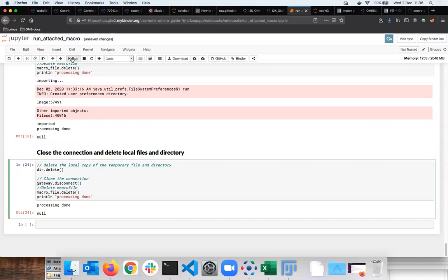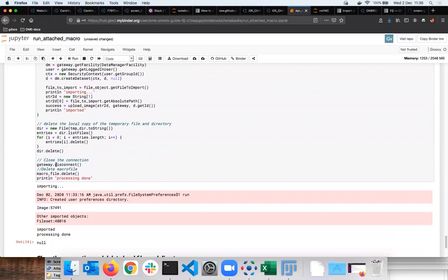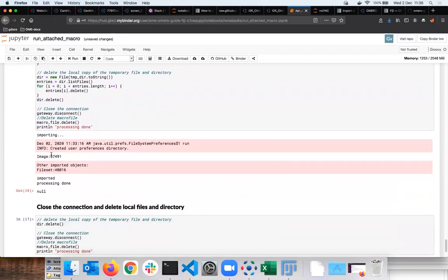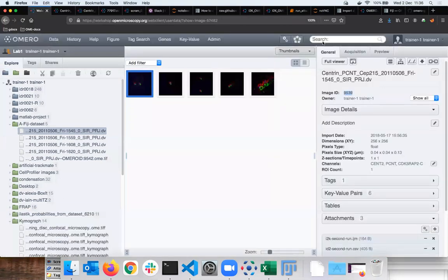And the good practice is to close the connection so that I don't tax the resources of the server unnecessarily. And the whole thing was done, and you see how easy it was to analyze an image. And I could have done, of course, in a loop on 414. I didn't have to change a thing, and I have a security that everything will work every time I come to it. And as Jean-Marie highlighted, if some other scientists will come to that, he will be able to reanalyze in the very same environment.